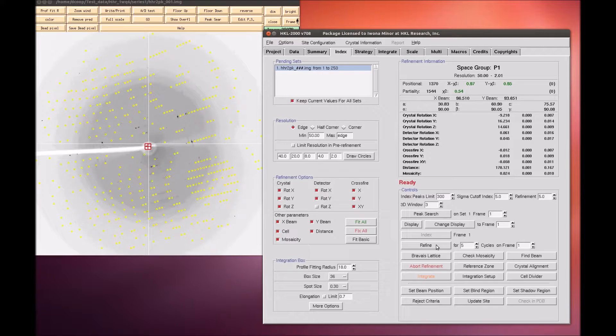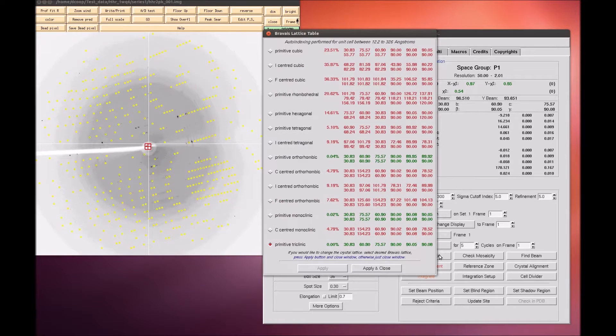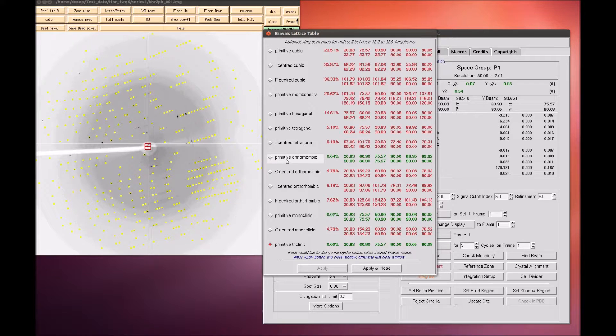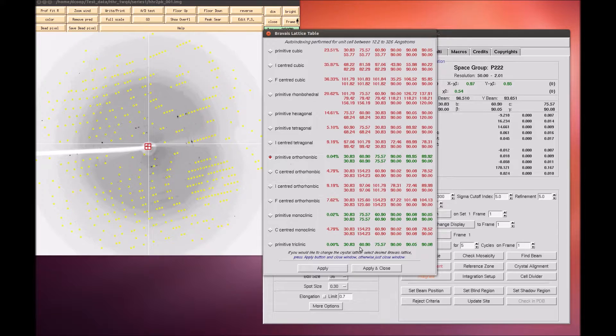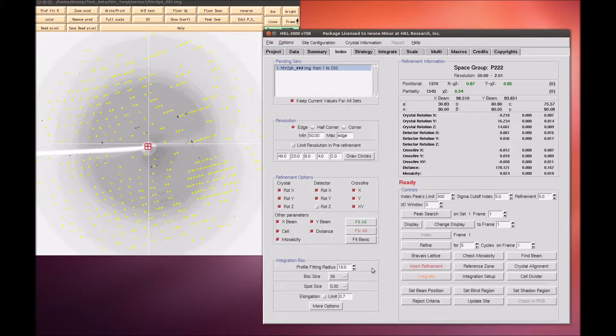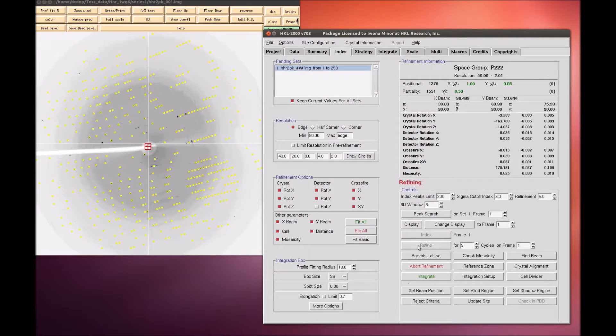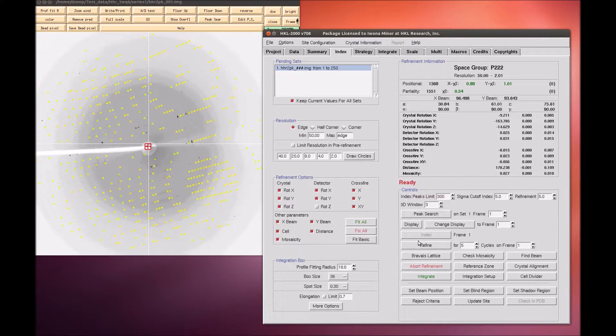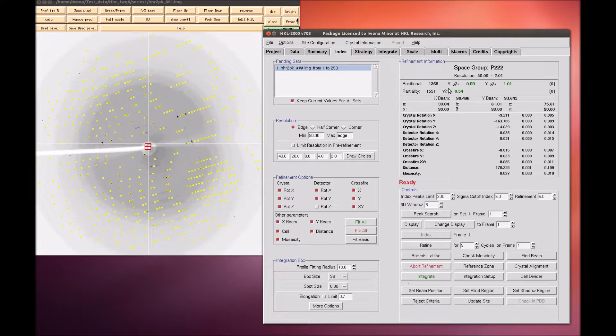At this point, revisit the Bravais lattice table and notice that the primitive orthorhombic class is the highest symmetry lattice with a low correlation coefficient. Select this lattice and apply and close this window. Click refine a few more times to ensure that the fit is still good. If the chi-square values shoot up dramatically during refinement, you should abort the refinement and re-index the data.